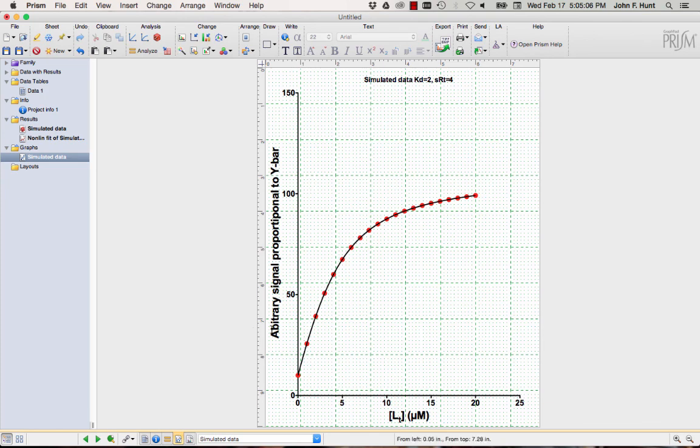Hopefully this screencast teaches you some more of the things. I think this covers everything in PRISM you need to know to get through the class. And hopefully it begins to help you think in a more sophisticated way about experimental design, which is certainly one of the goals of the course.